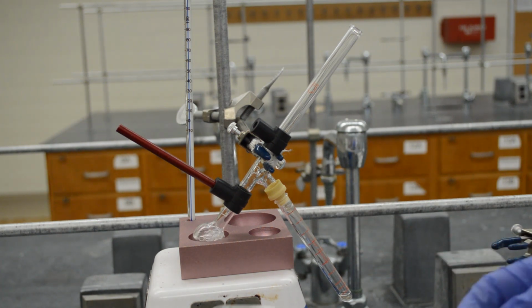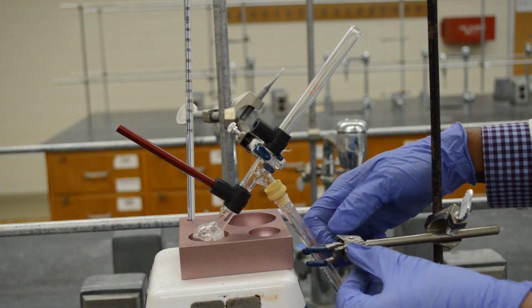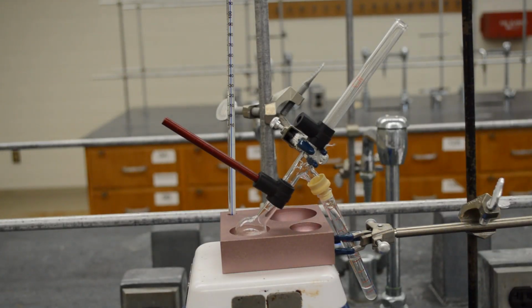It's about 4 minutes now. I already got a few drops of organic, that is the top phase, and aqueous, the bottom phase. I don't want to lose the product, so I'm going to clamp this test tube. It's about 20 minutes. Half of the reaction mixture is now in the test tube. You can see the bottom aqueous layer and the top organic layer.